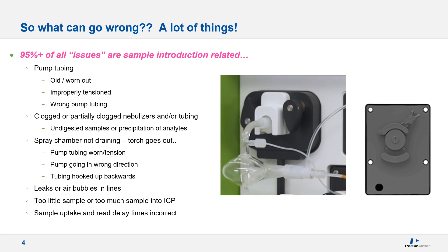So what could go wrong? The answer is a lot of things. One thing to remember is that 95% or more of all issues in ICP-MS are sample introduction related — meaning the peristaltic pump, the nebulizer, and/or the spray chamber. Pump tubing could be old, worn, improperly tensioned, or the wrong type. You could have a clogged nebulizer, the spray chamber might not be draining correctly, or in extreme cases fill up and the torch goes out. Other issues include leaks, air bubbles causing signal spikes, too little or too much sample in the ICP, and incorrect sample uptake, re-delay, and wash times.